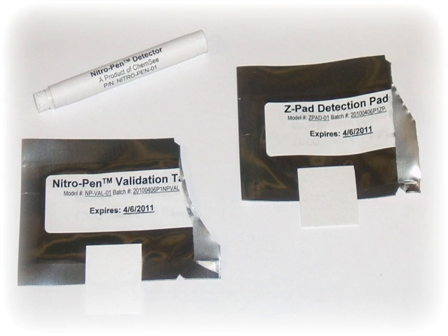Before demonstrating the use of the detector, I would like to go over the parts of the detector. There are six important components for the nitro pen 04 detector: the swabbing detector, ampule 1, ampule 2, the detector tube, the Z-pad, and the validation pad. The Z-pad and the validation pad are the upgraded options available for the nitro pen.